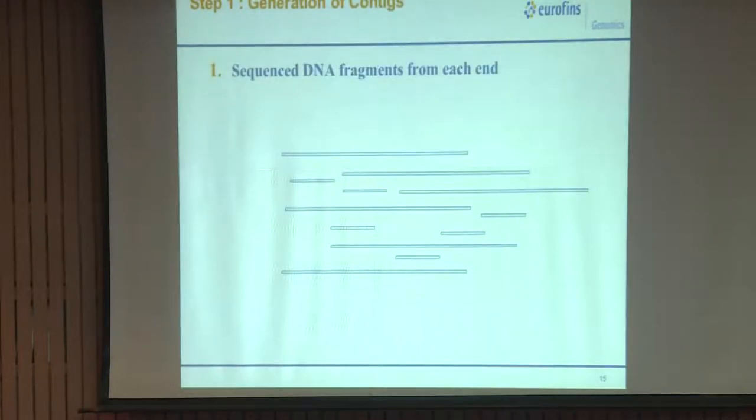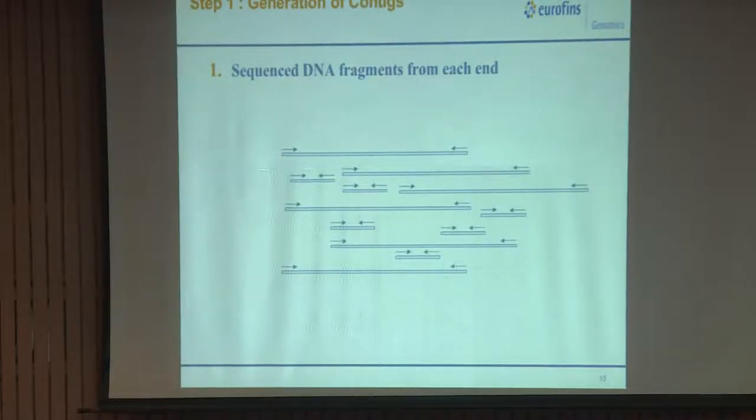We'll see what the softwares are. SOAPdenovo is one, CLC is one. These are different softwares. We also have a list, so you can see the list. This is just a presentation of how we create a contig.